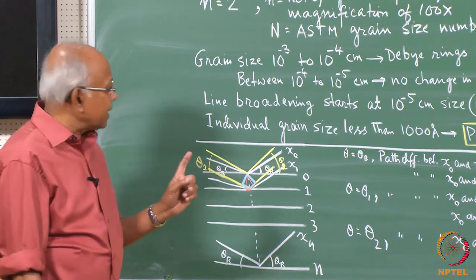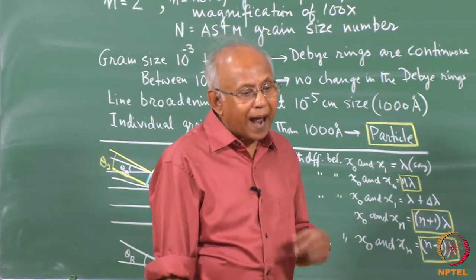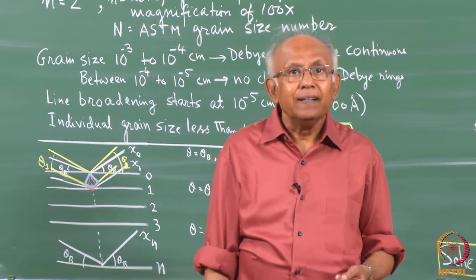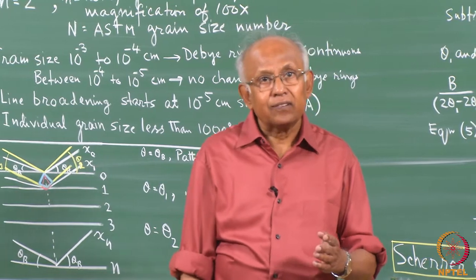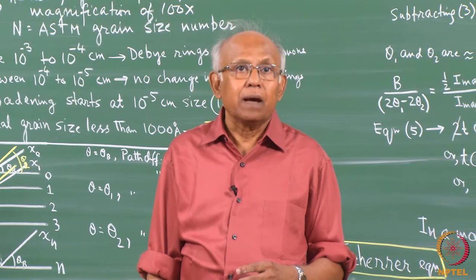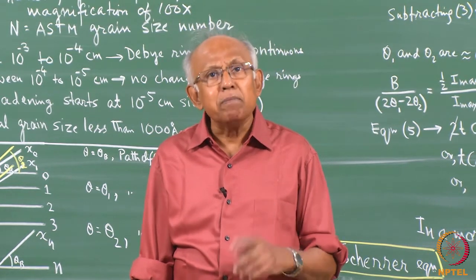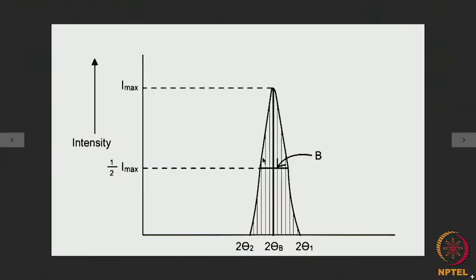So, this is a very important observation, that even when Bragg's law is not perfectly satisfied and the incident angle of the X radiation is slightly more or slightly less than theta b, even then we will get some intensity, as a result of which an actual diffraction line profile looks like this. So, this is practically the cut off angles beyond which there won't be any diffraction possible.